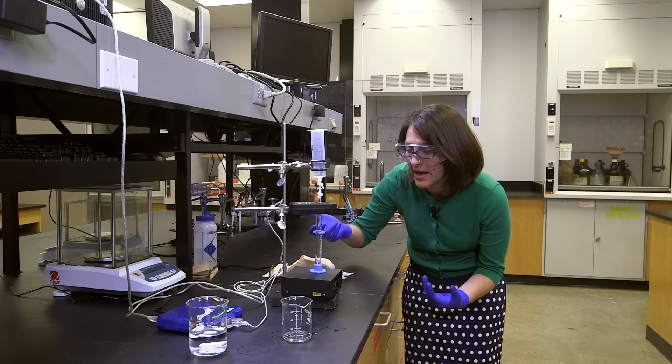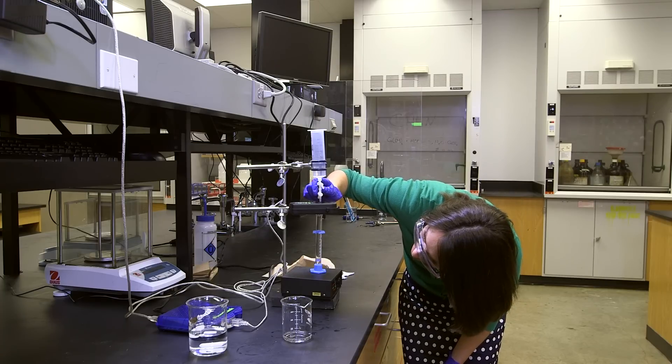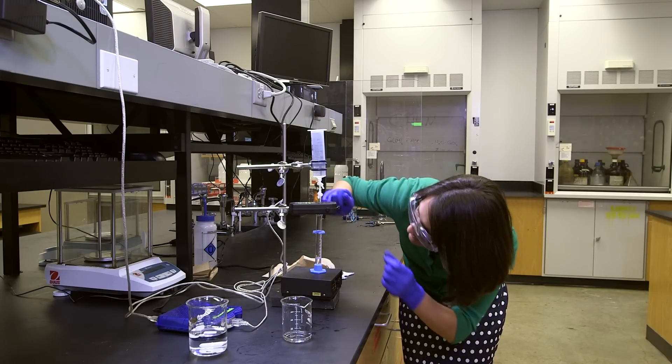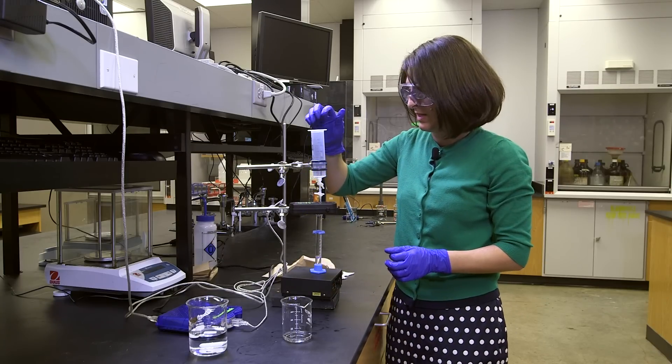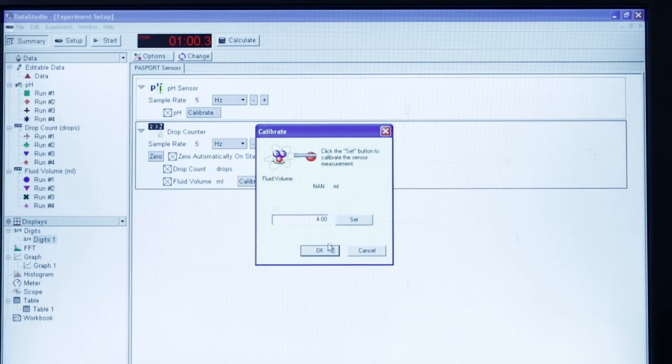And in the book, it has you go to 10, you can do five. You just want to make sure that you're going to measure accurately. I think I'll go to four. Okay. All right, so then I'm going to tell it four mils.